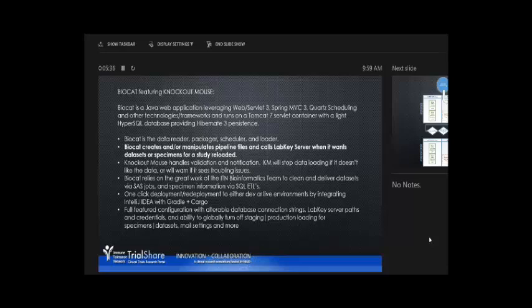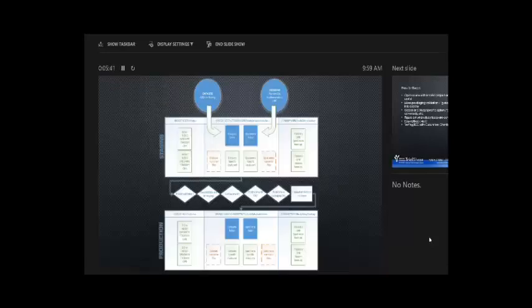This is a brief diagram that I'm not going to go through. Look at it at your leisure or talk to me about it. It just shows the different steps that happen with data sets coming in, specimens coming in, and some of the different things we do that go or no-go files depending on whether there was an issue. And then in the middle are some of the validations that we decided need to be made once we've got it on the staging server.